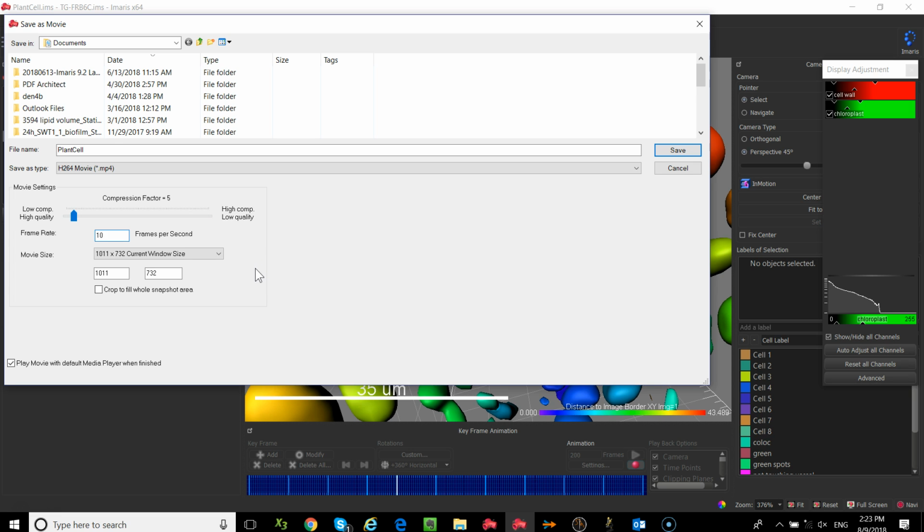Oh, sorry, yeah. Just a quick question. We have this experience where when we make a movie, sometimes we make it in Windows and then it doesn't play on Mac, and if we make it on Mac, maybe it doesn't play in Windows. Do you have a suggestion for a workaround, which format is basically useful for both? Okay, so typically AVI is the one I would recommend for both.